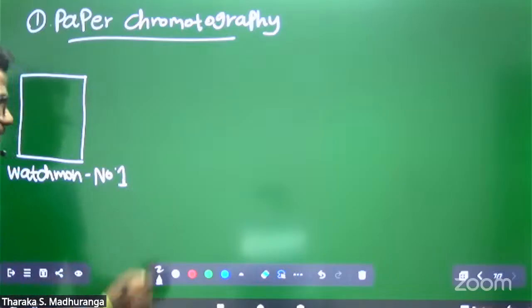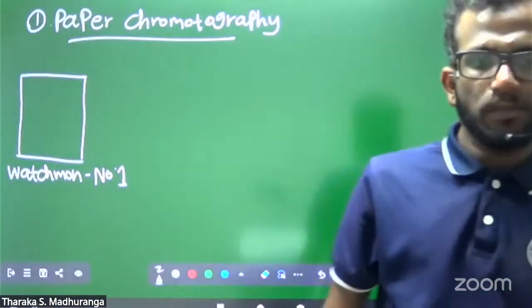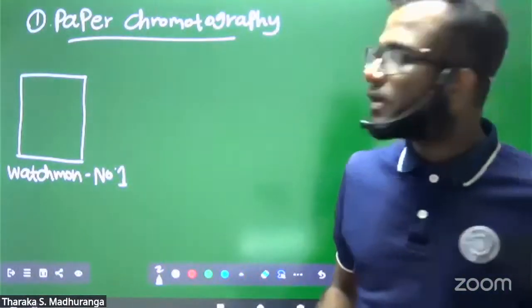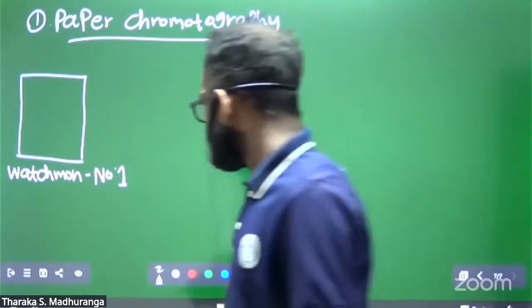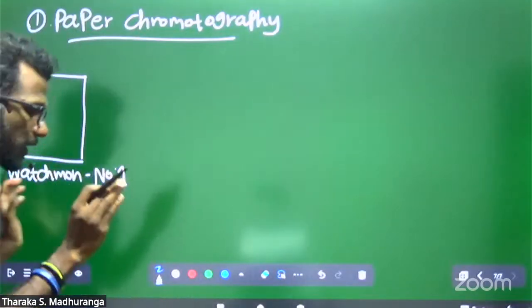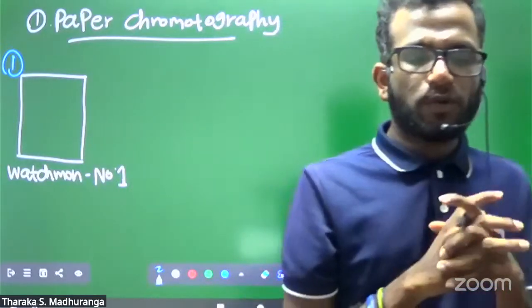Whatman is the scientist who found this. Therefore, your first step is to get a Whatman number one chromatography paper.